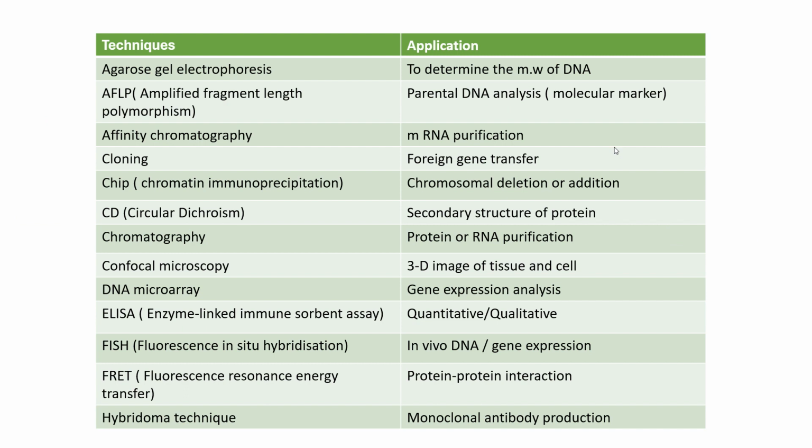The application of this technique is to determine the molecular weight of DNA. By this technique, we can determine the molecular weight of DNA. The larger molecular weight DNA moves slower than the smaller molecular weight DNA.